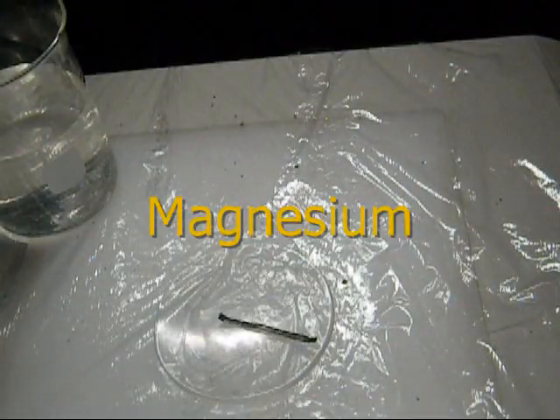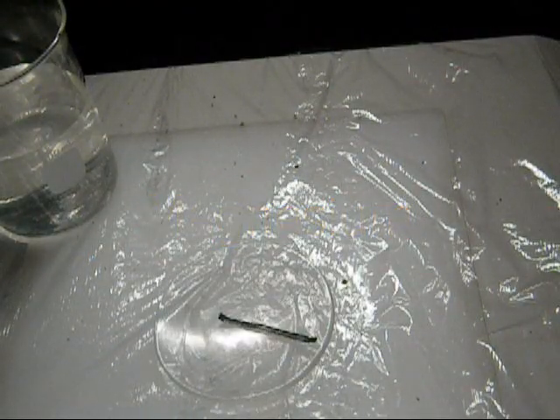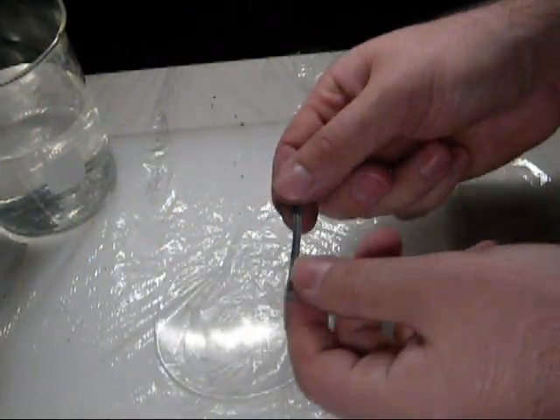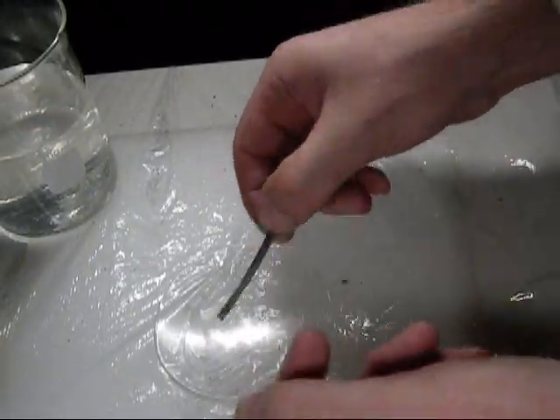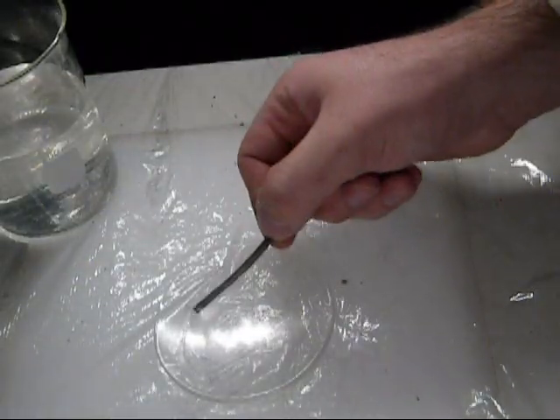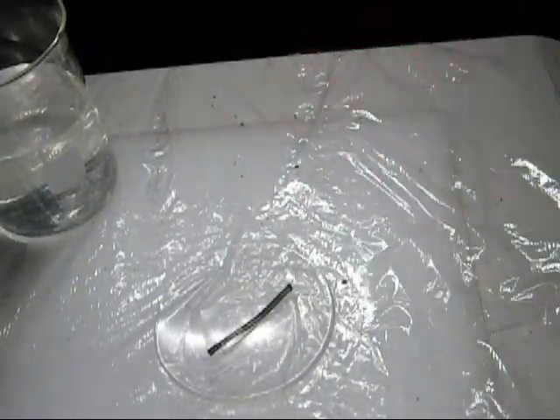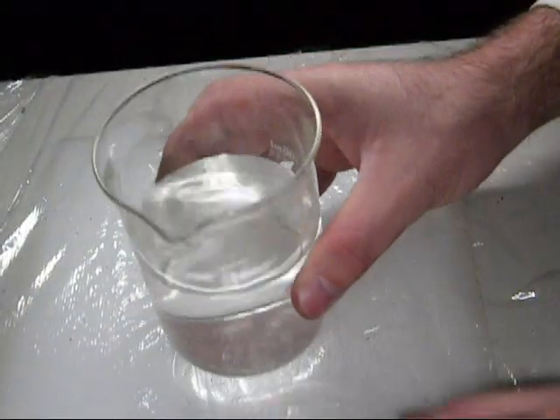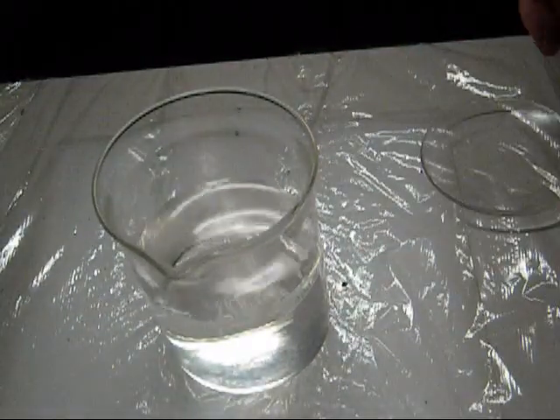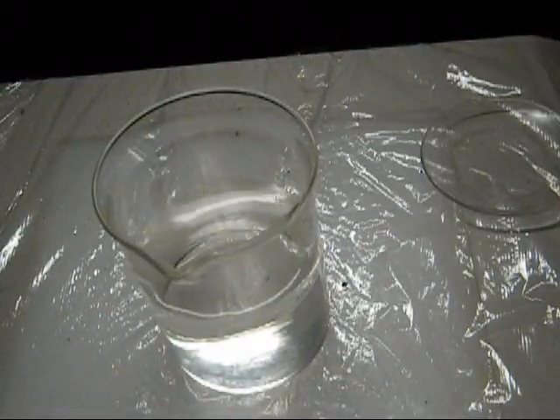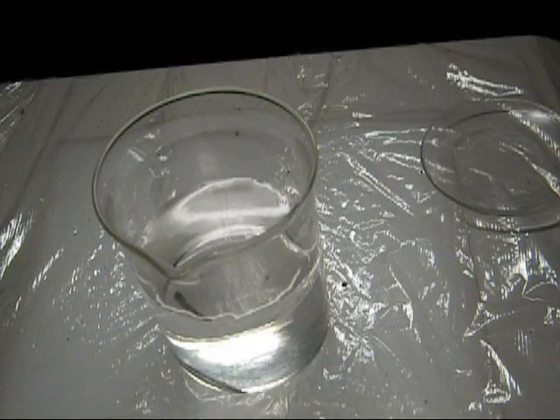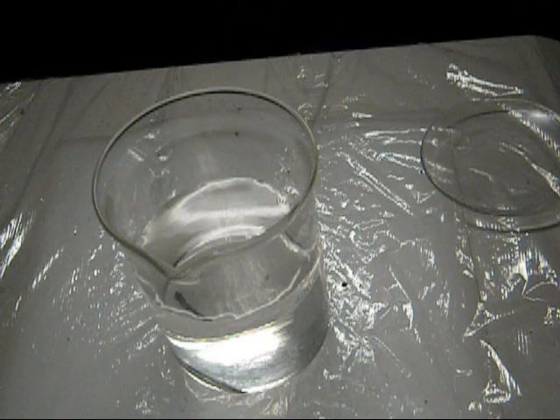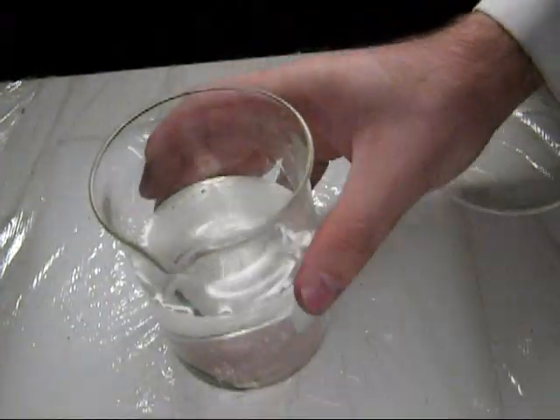So starting out here we have magnesium, and you can see it's a metal. It's got a little bit of an oxide coating on here, a little bit of a black coating on its surface, but this is magnesium metal. And you'll notice that when we put magnesium into water, we're going to test all of our reactivities by dropping the metals in water. A whole bunch of nothing happens. So that's magnesium. I'll leave it sit there. We might come back to it later.